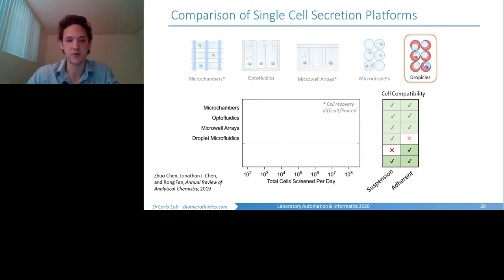These have been tuned over the last several decades to be very high throughput machines for analyzing micro objects or cells. The other thing is that the way we're forming these compartments is done massively in parallel. It's not a serial approach. You're not manually pipetting single cells. You're not sequentially generating droplets in this case. So this allows us to parallelize a lot of the workflow.